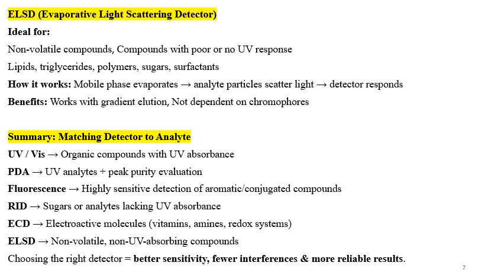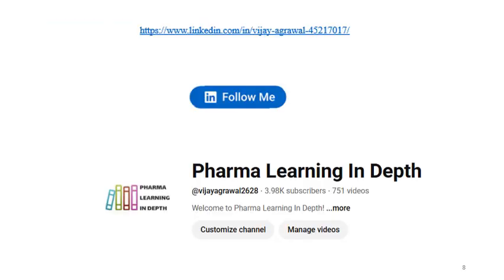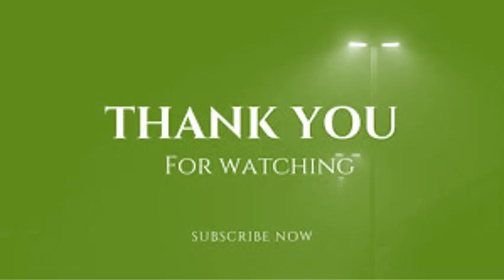So if you select the right detector, then you will get better sensitivity, fewer interferences, and you will get more reliable results. So this is regarding the HPLC detectors.